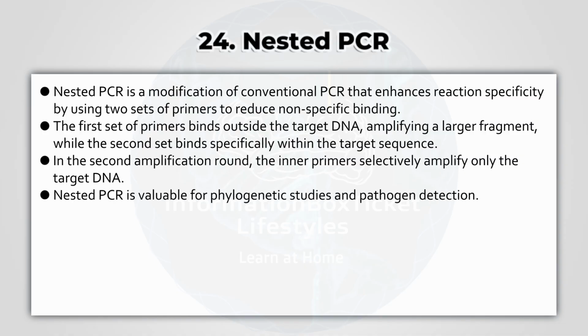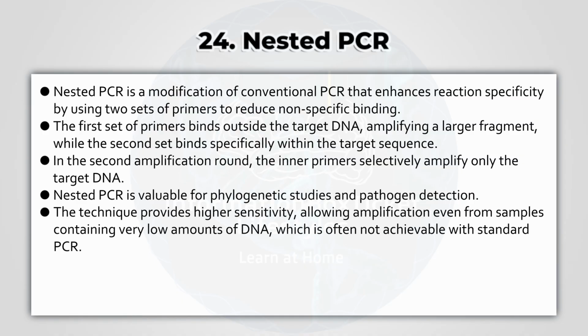Nested PCR is valuable for phylogenetic studies and pathogen detection. The technique provides higher sensitivity, allowing amplification even from samples containing very low amounts of DNA, which is often not achievable with standard PCR.